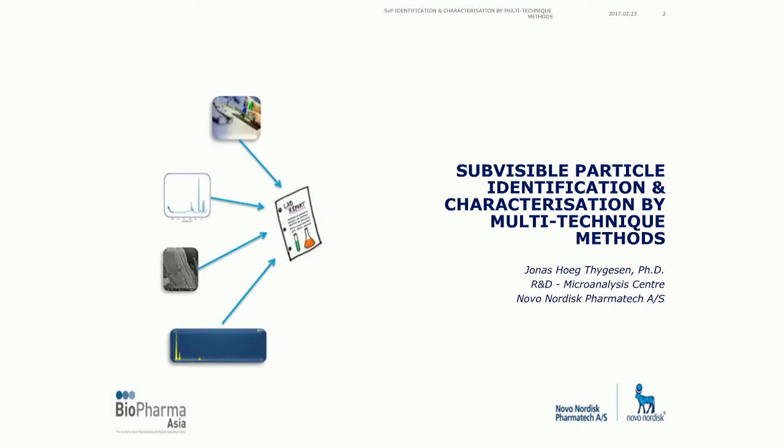But anyhow, I am going to discuss with you some different methods for particle identification and characterization. I'm going to speak about the subvisible range of particles, but many of these techniques, as you will see, will also be usable if you have issues with visible particles.